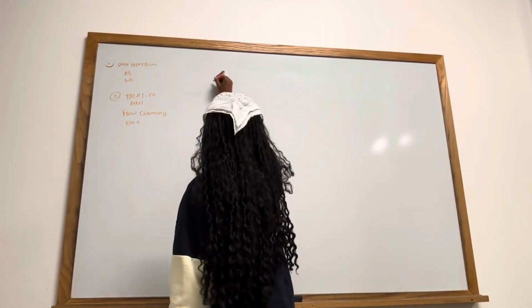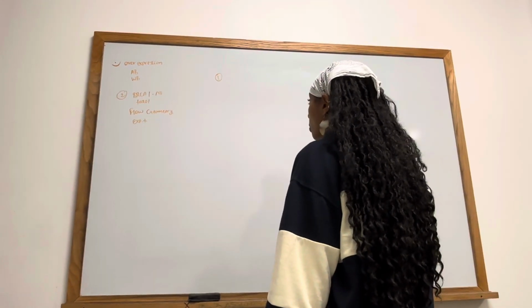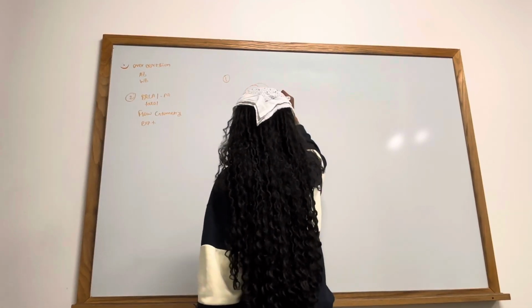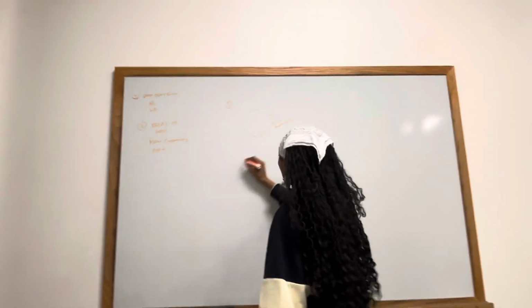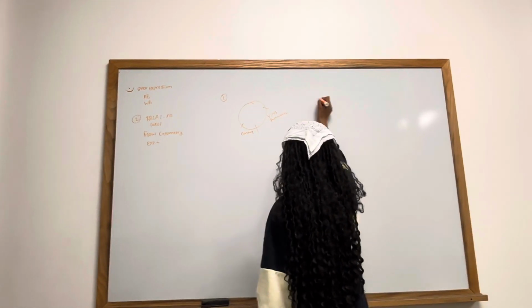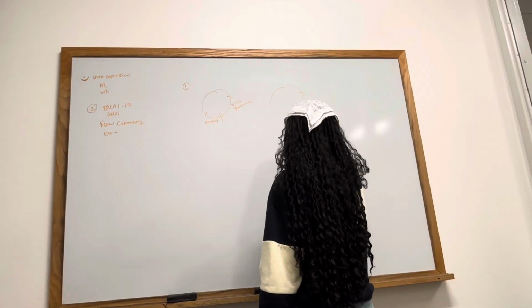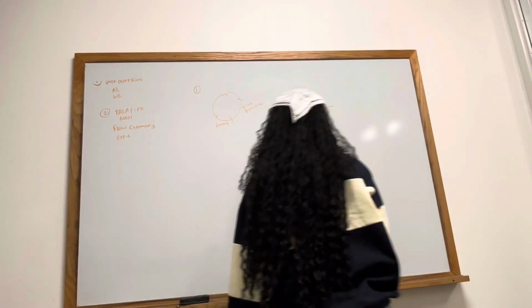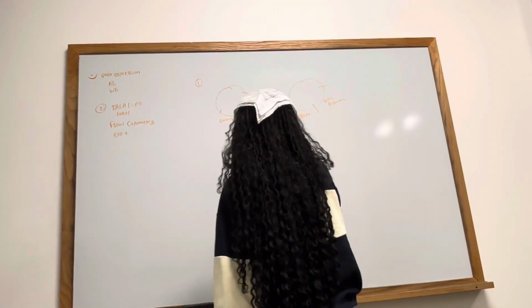Okay, so for the first question, what we're gonna do is overexpression of BRCA1. To do that, we're gonna transfect a virus promoter plasmid. So we're gonna use a virus promoter, first with our control gene, and then for the second one, we're gonna do virus promoter with BRCA1. So after we do that, we're gonna have 293T cells, I think.